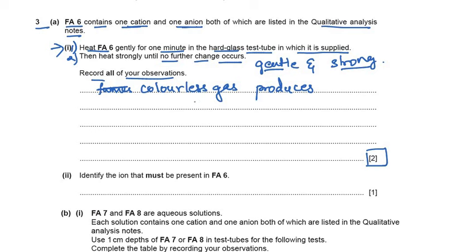I'll give you the observation here because it's a virtual reading. So colorless gas is produced. Now this colorless gas turns damp red litmus paper blue. So I'll write that colorless gas produced turns damp red litmus paper blue. Now we need to understand, just check that red litmus paper turns blue. So I'm just writing it here, and we need to understand that if this is the gas, we need to check it with damp red litmus paper, or check it for carbon dioxide or hydrogen.